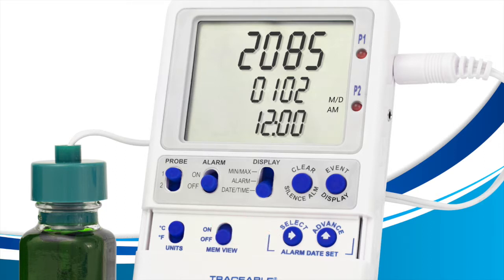As you can see by this lesson, the Select button allows you to select fields on your screen. Now, let's learn what the Advance button does. The Advance button allows you to modify the year, date, and time on your screen, but it will only change the value of a field that has been selected by the Select button. Remember, the area that's flashing is what's currently selected. Since no fields are currently flashing, pressing the Advance button does nothing as nothing is selected.